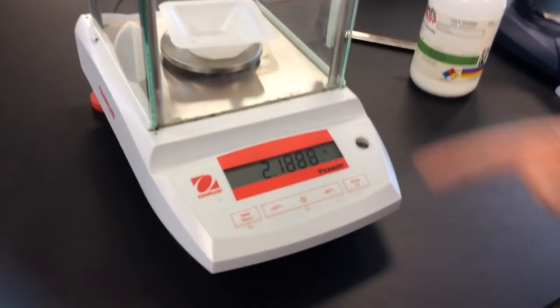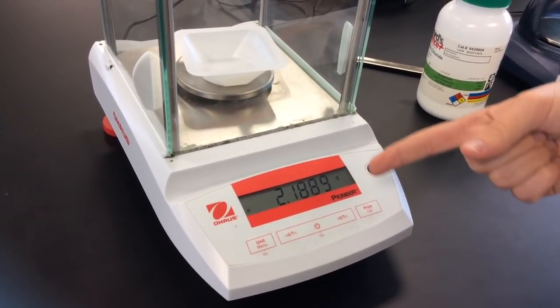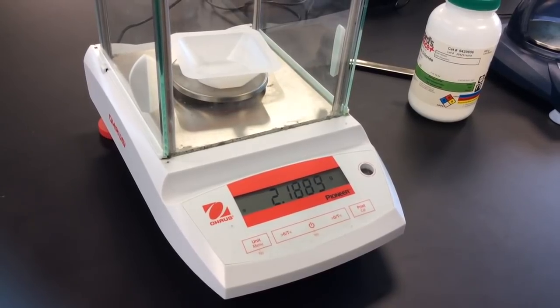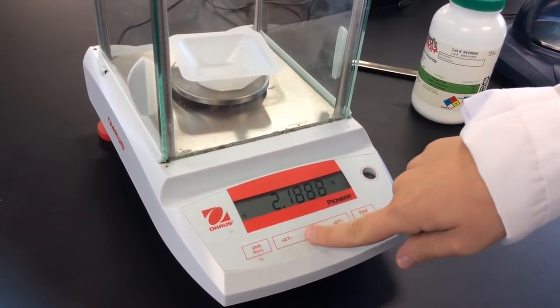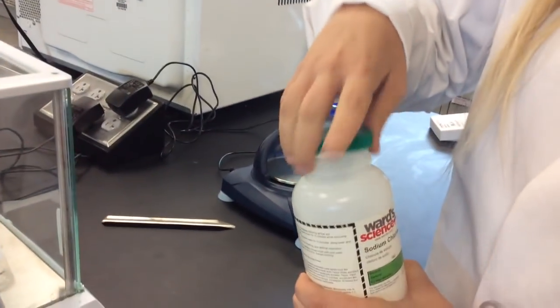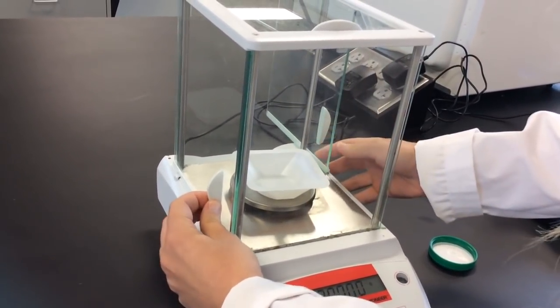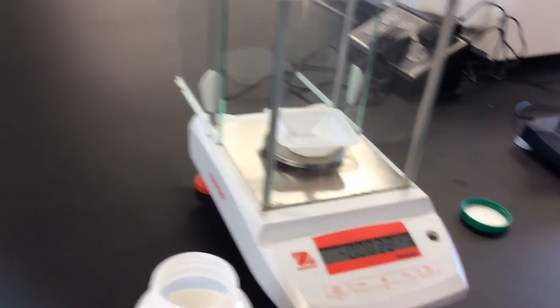Now we see that this is 2.1889 grams. We don't want this included in our measurement when we are weighing out samples. So we have a function called taring — you push tare, and ta-da! Now it's zeroed out with the weigh boat on it. So when you go to weigh out some sodium chloride, you leave that on there.